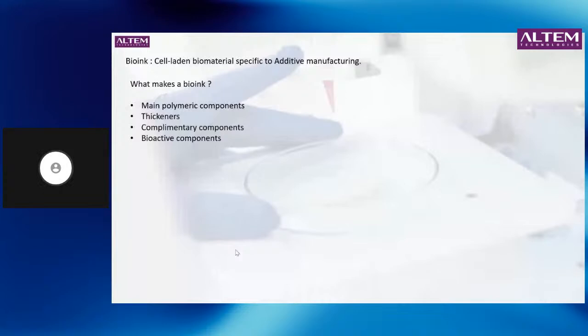Next is the bioactive components. Bioactive components will be the cell suspension media. It will be again the cell type which is used within it. It'll also be the type of components that will aid in terms of using that material.